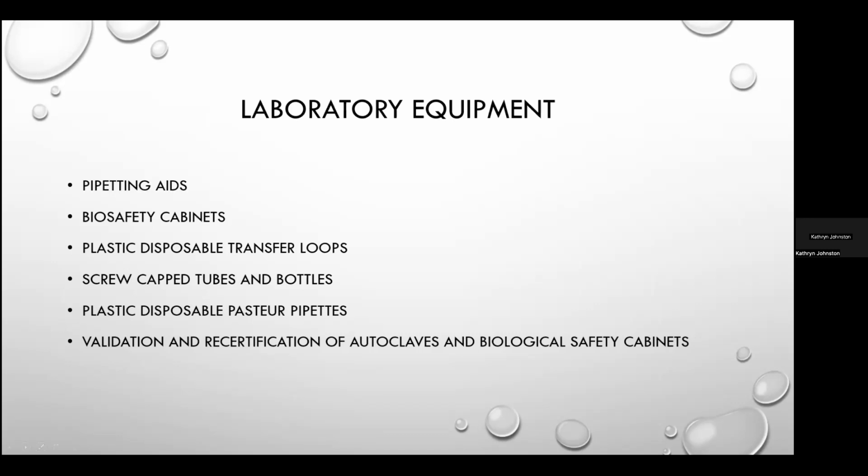Okay. And then with respect to the autoclaves and the biological safety cabinets, autoclaves and BSCs should be validated with appropriate methods before they're put into use. And the recertification should take place at regular intervals as recommended by the manufacturer. So it's not a one and done. You need to make sure that your autoclaves and your biological safety cabinets are being validated on a regular basis to ensure that they're working appropriately and properly.